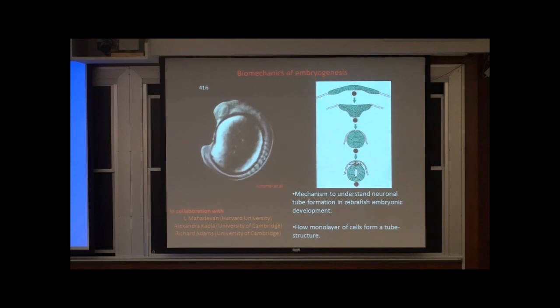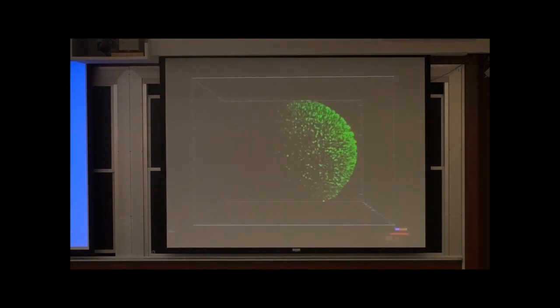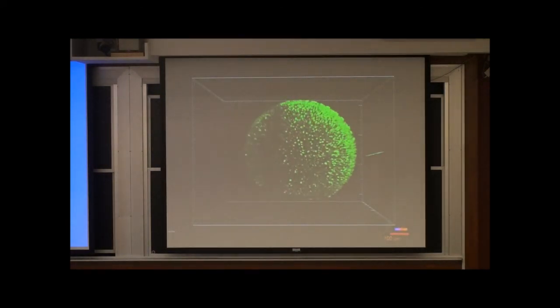But one of the issues of this kind of non-fluorescent imaging is that you don't have the resolution of which cells go where. And last week Keller also told us that for some of these things, it took him 15 years to convince people which cells go in which direction. But ideally, with this kind of imaging method, you can really see where each of the cells is going. So you can see one of the movies of the embryo development.